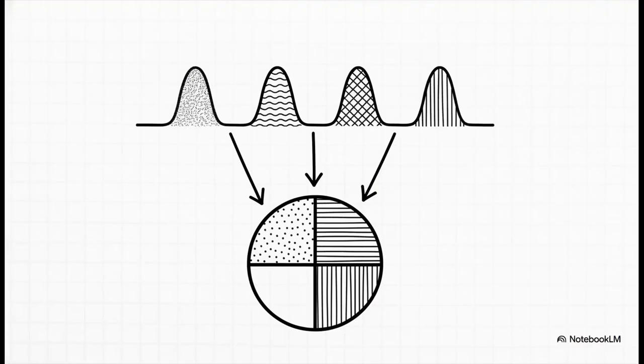We use this last technique under a very specific set of circumstances. Normalization is specifically for when every single component in a mixture elutes from the column and gets detected. If we know for a fact we are seeing the whole shebang, we can rely on a very simple rule. The sum of all components has to equal exactly 100%. Once we establish the relative response factors for each component, we can easily calculate their relative percentages based just on their peak areas. It is a really elegant, mathematically beautiful way to profile an entire mixture without ever needing to know the exact injected mass.